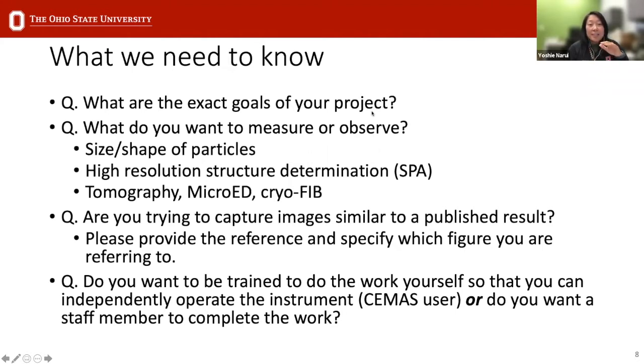So the last thing, which I think is the most important in terms of being a user, is if this is a student or a postdoc or a trainee, do you want to be trained to do all of the experiments yourself so that you can operate things independently? Or do you want a staff member to complete the work in a timely manner, like if you have a strict deadline or something like that? So that will determine whether or not you should sign up to be a CEMAS user, or whether you just want to use us more as a service-based facility. So you should decide before contacting us what your intention is there.